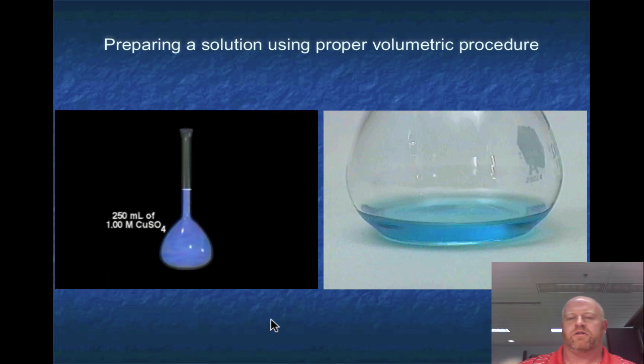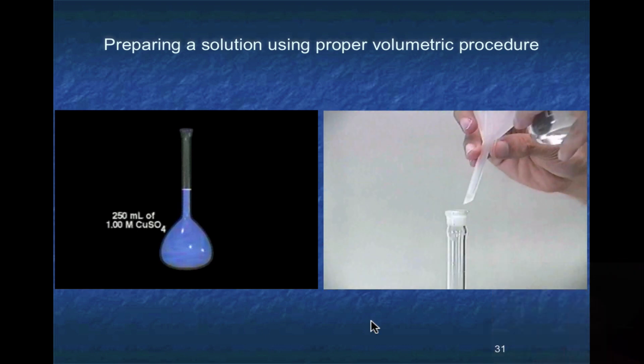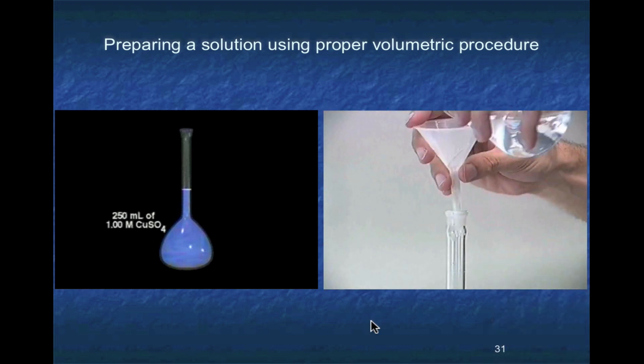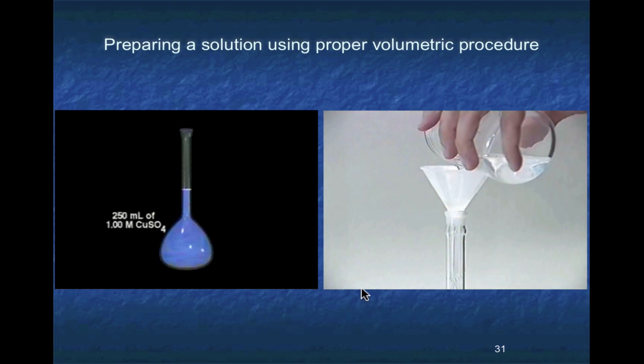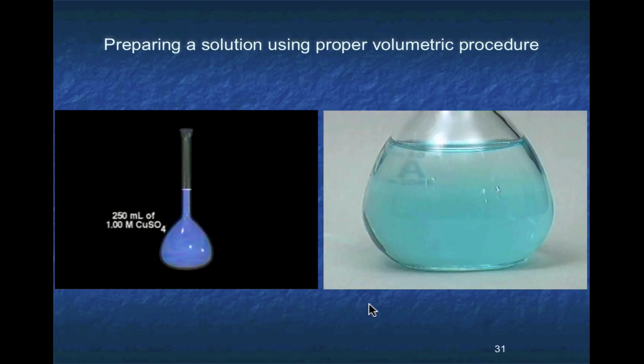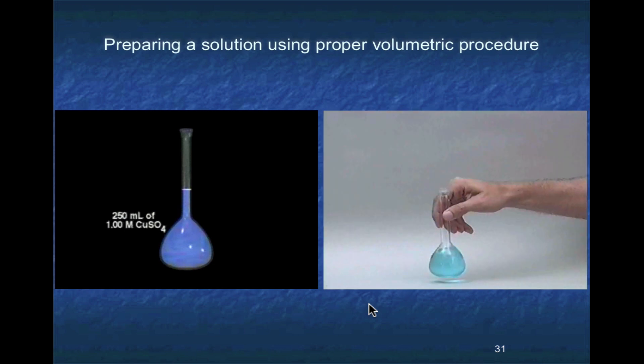This one focuses on the dilution part and making sure that you put in the proper volume. Ready for dilution, use solvent to wash any residual solute from the neck of the flask. Take this last opportunity to mix the solution well before diluting it to the mark.